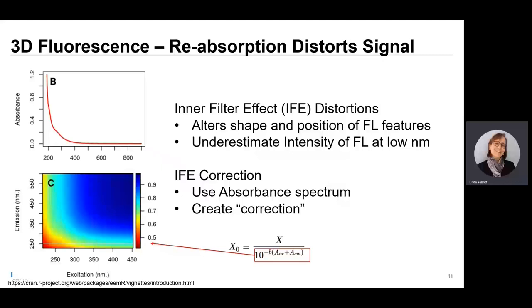The pattern of an EAM can be distorted by the self-absorption of a sample — this is called the inner filter effect. This effect can actually alter the shape and position of fluorescence features in the EAM. The good news is that it can be mostly corrected using the absorbance spectrum of the sample. In this image, the trace labeled B is the absorbance spectrum of a sample, and the matrix labeled C shows the wavelength dependency of the IFE correction. You can see that at the bottom left-hand corner — the low excitation and emission wavelengths — there is significantly more correction than for other areas in the matrix.